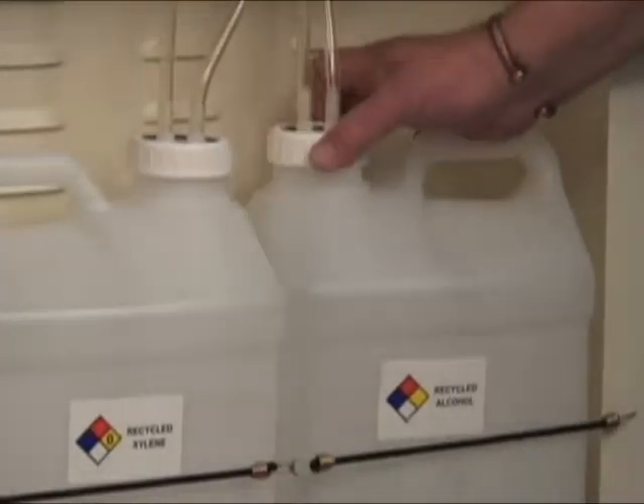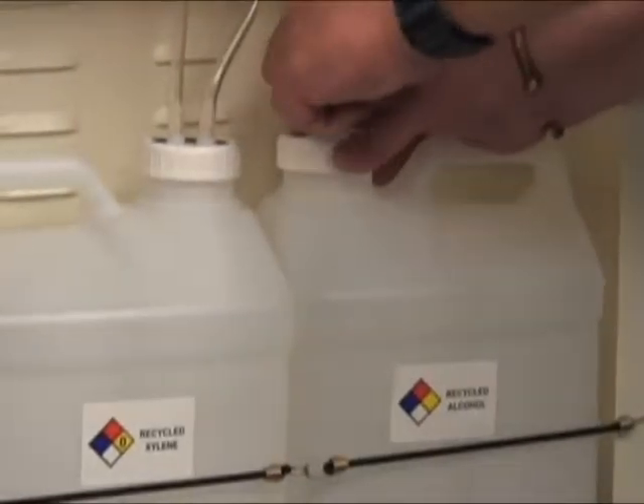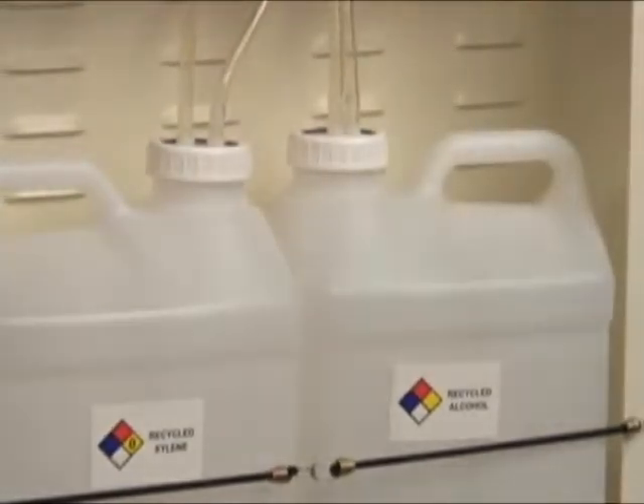So we're venting through the entire process. You just take this, screw this down firm — doesn't have to be rock tight.